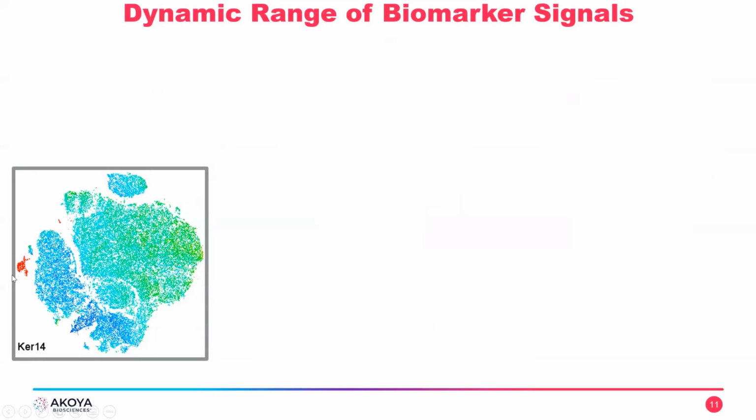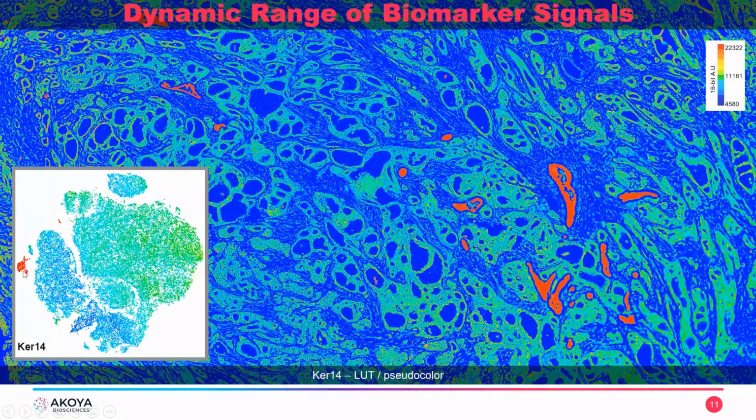Now, let me also emphasize that this would be the end result of many single-cell sequencing studies, for example, because they don't have spatial resolution. If we did this experiment, we would just know that there are these keratin 14 cells. We would know the number, we know they're distinct, and we probably know that this would change in a different experimental condition. But the lovely thing about CODEX, any type of spatial multiplexed analysis, is that we have side by side.